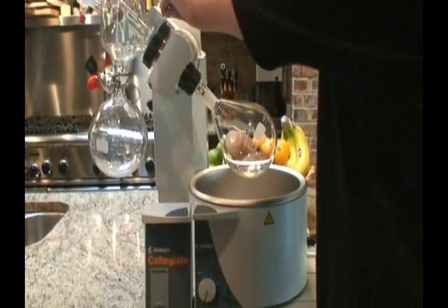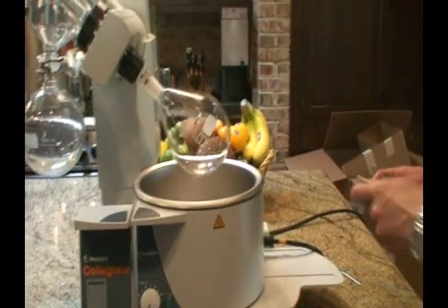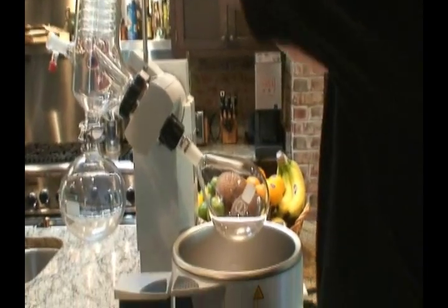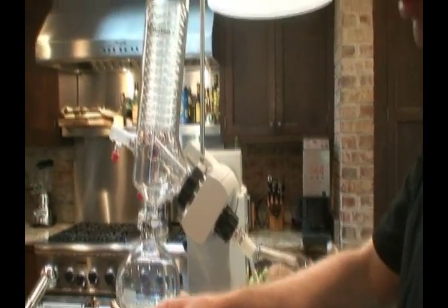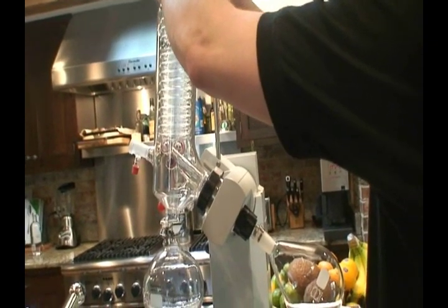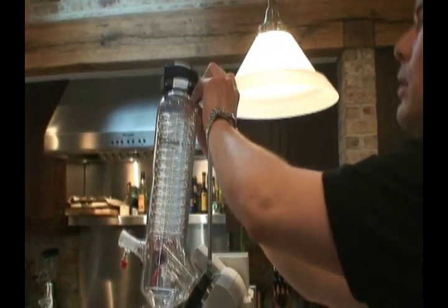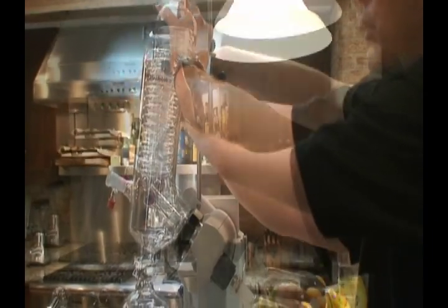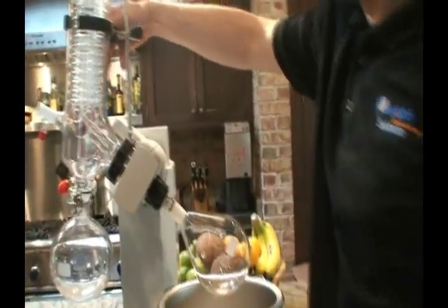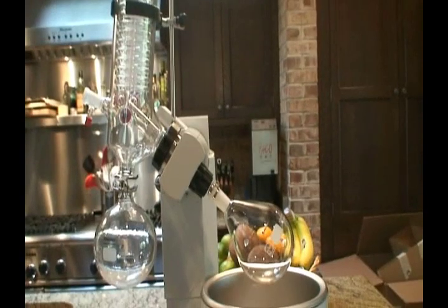I'll just run through what this unit is going to do. We will be rotating this flask in a heated bath, therefore creating a lot more surface area for evaporation to take place. The system will also be under vacuum, which will promote boiling or vaporizing of whatever liquid is in there at a lower temperature. By reducing atmospheric pressure, we shift the boiling point, and by rotating the flask, we significantly increase the surface area for that liquid to go to vapor.